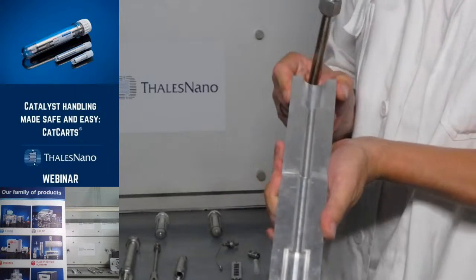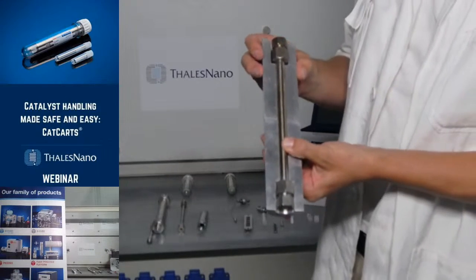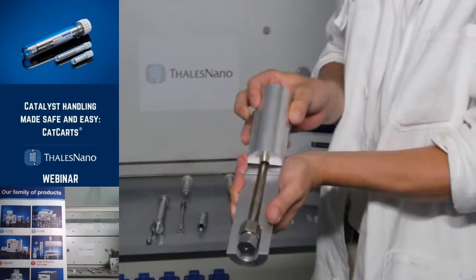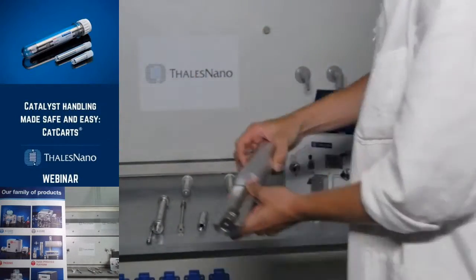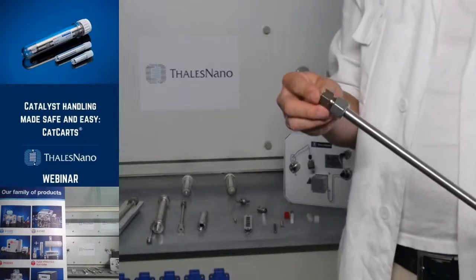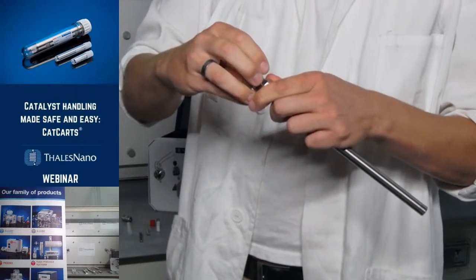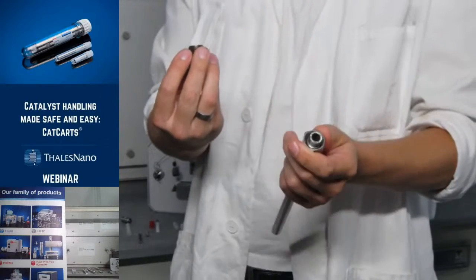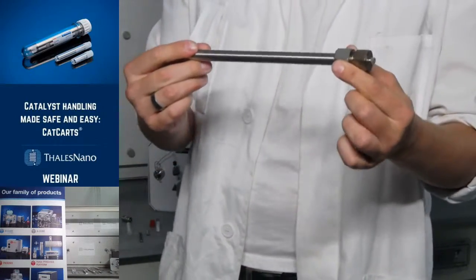And this is a so-called CatCart holder for the Phoenix flow reactor. Here you can put the metal sealed cartridge inside, and using 4 of these aluminum holders you can put this inside the inner heating blocks of the Phoenix flow reactor. Changing the catalyst in the metal sealed cartridges is easy. You just have to loosen the ends, and you can wash out your catalyst from the tube, fill it with your own new catalyst, close it back again, and you can reuse the cartridge at least 5 times.